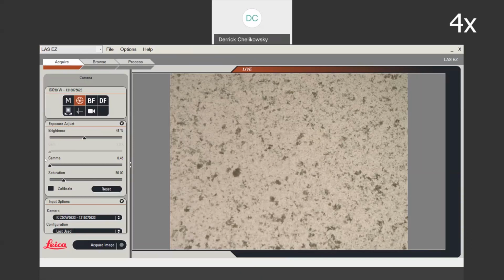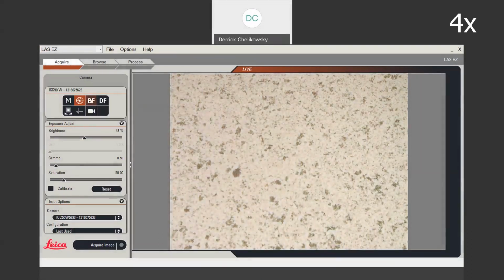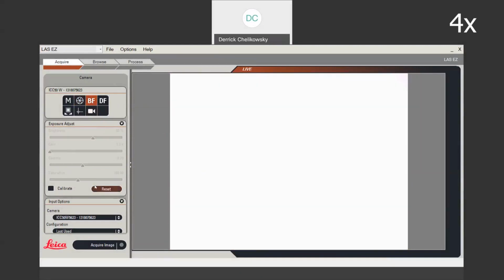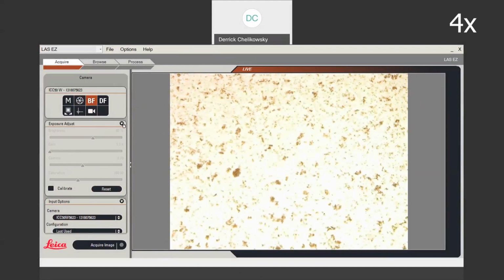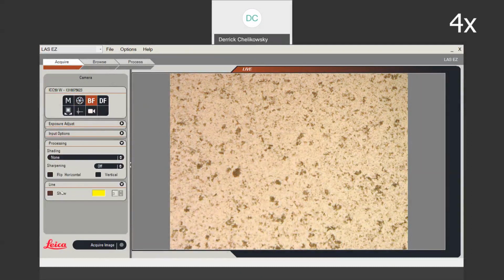Now, as you can see, there are several types of cells here. There's clumps, there's some debris. This is some baker's yeast that we had here in the lab that I threw in a dextrose tube and then let it grow a bit at 37 degrees Celsius. And as you can tell, the cells themselves are quite small. They're big for a microbiology class, but for your general person, they're actually quite small.